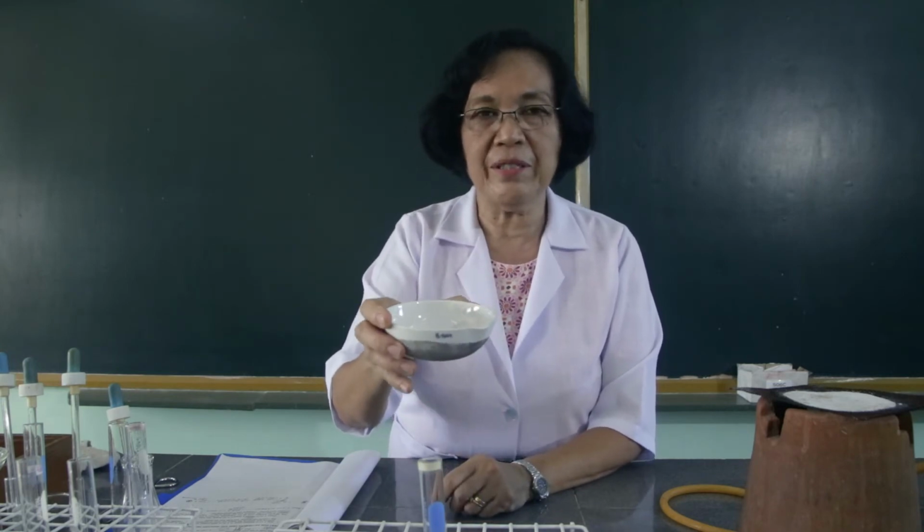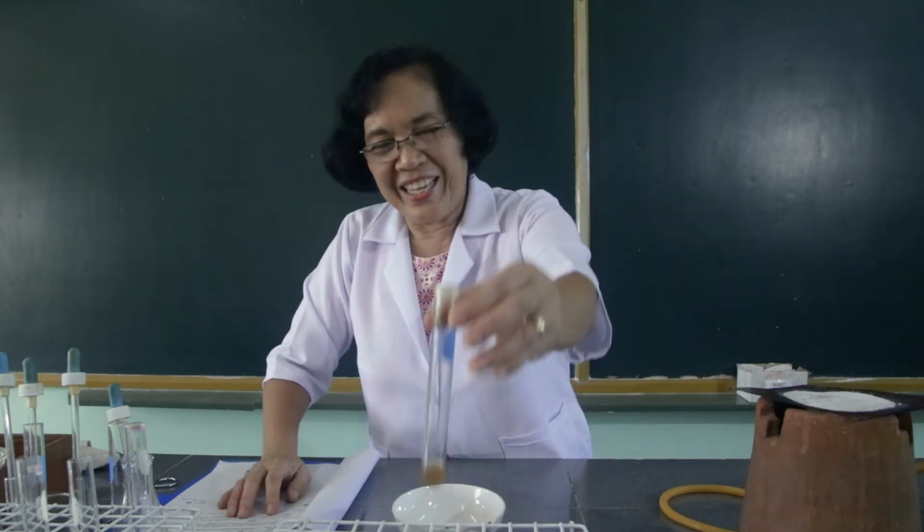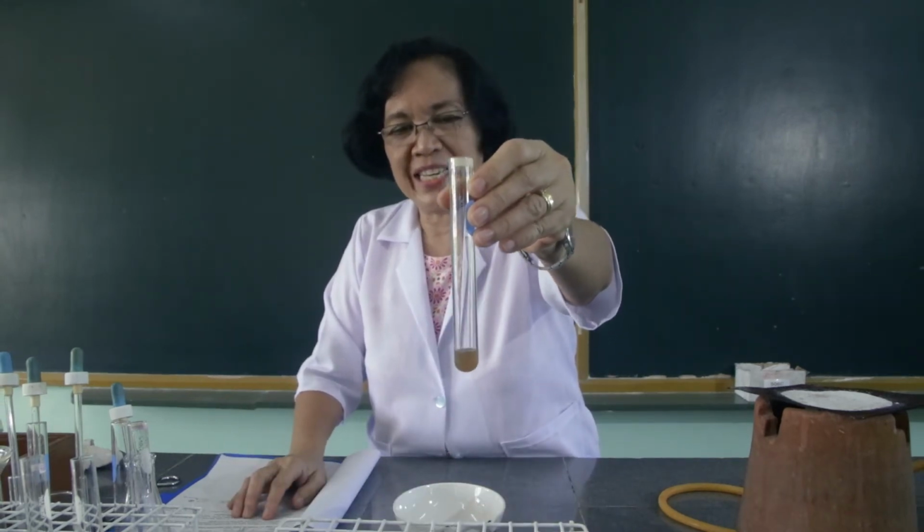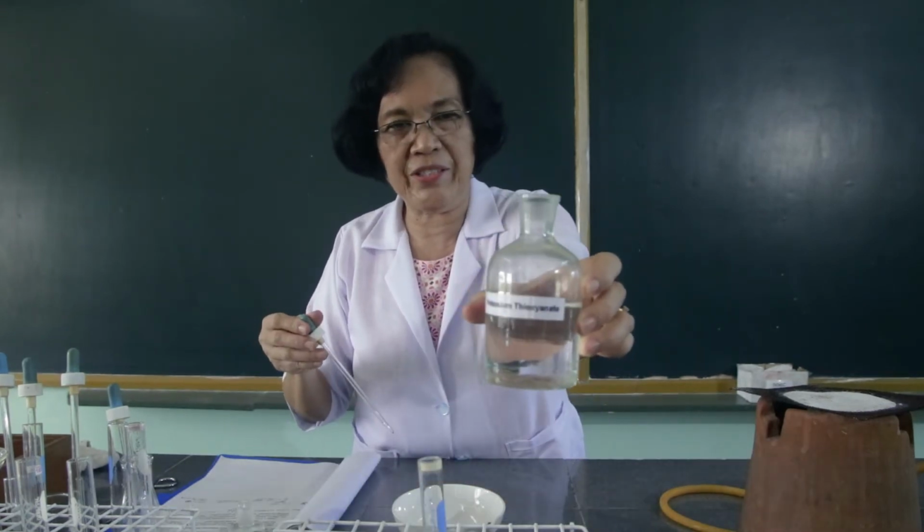I'm going to transfer the dissolved residue into the test tube. And I'm going to add to this the potassium thiocyanate. This is the potassium thiocyanate.